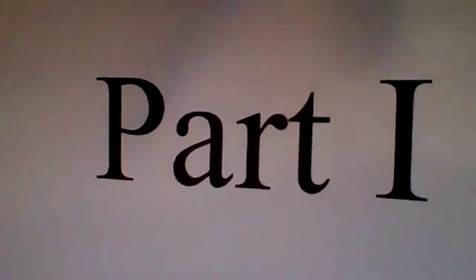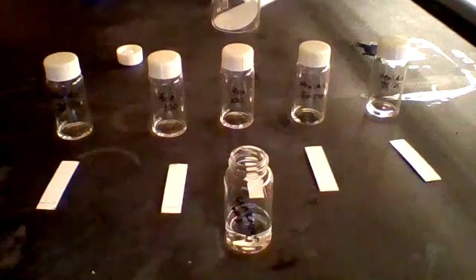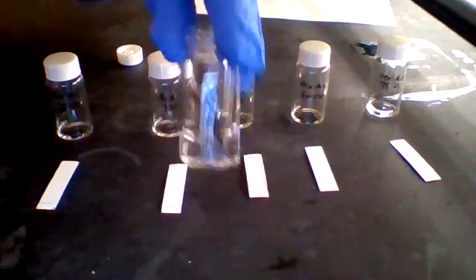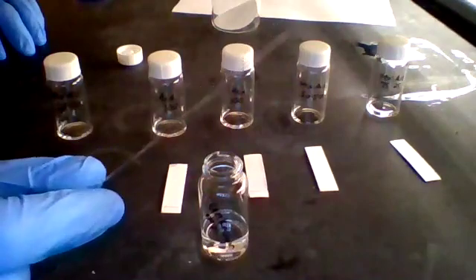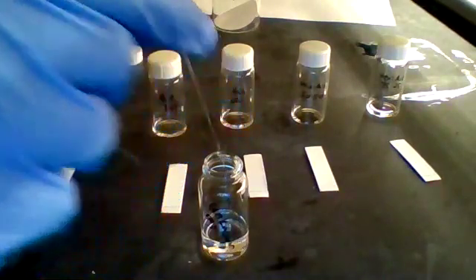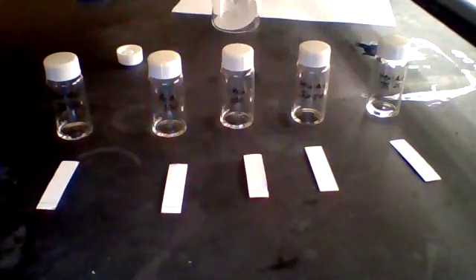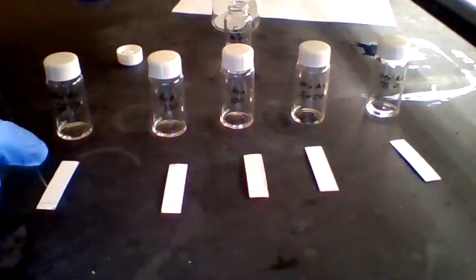All right, so we're ready to run our sample on TLC for part 1 of the lab handout. So we have our unknown number 3 sample in our vial here. What we're going to do is take a TLC spotter, dip it into the unknown solution that contains our unknown compounds. And what you're going to do is spot it once on each of these 5 TLC plates.